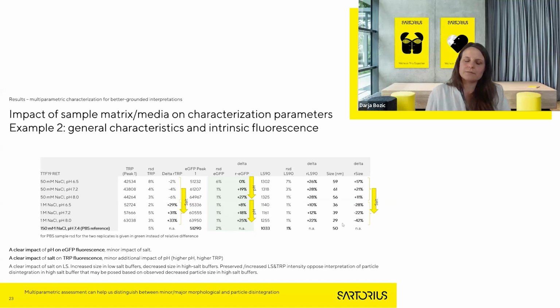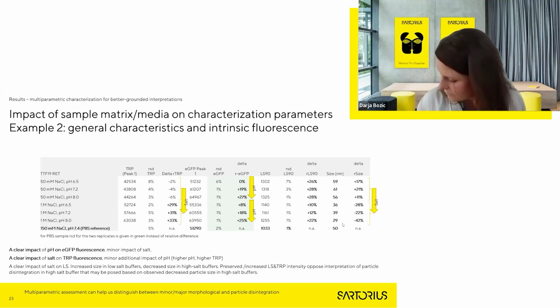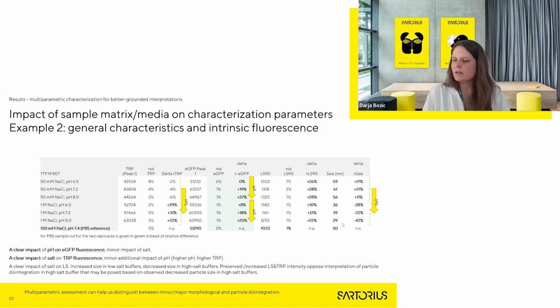Thank you very much. Another question: is it better to lyophilize the exosomes after isolation or use them as such? And at what pH of PBS are they stable? Particles after lyophilization. This is a hard one, actually. I don't have very much experience with stability during lyophilization processes.